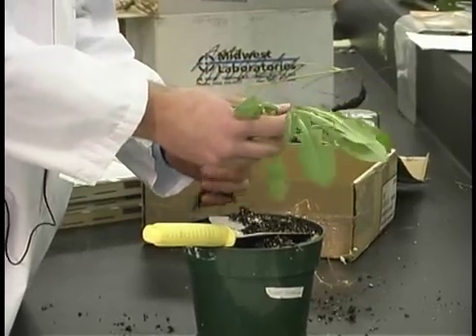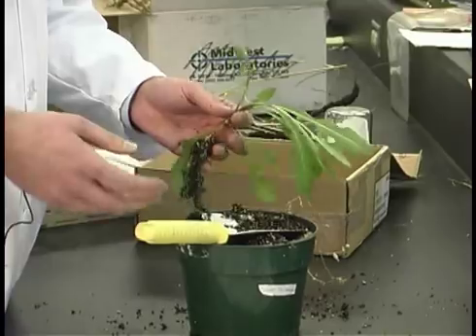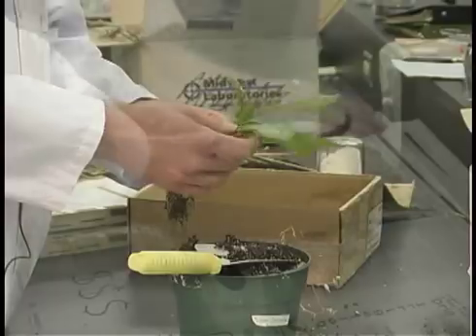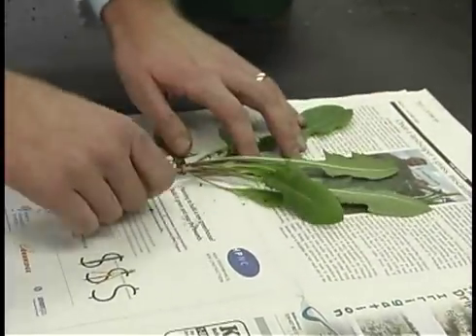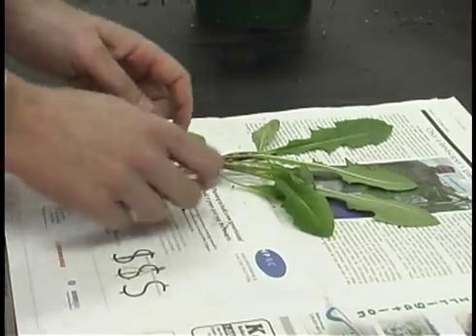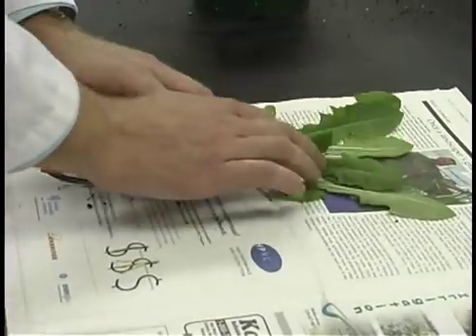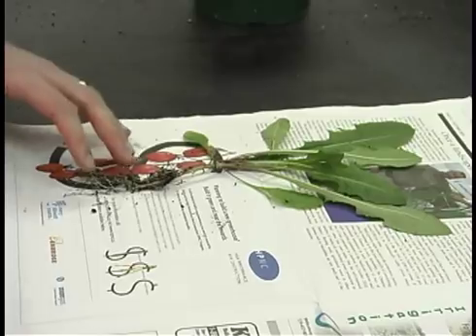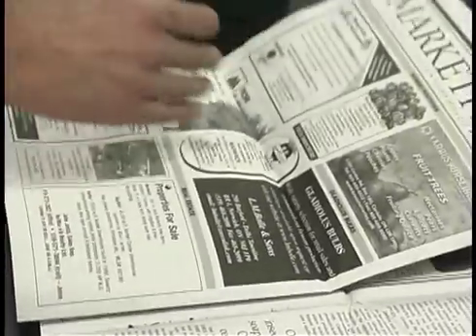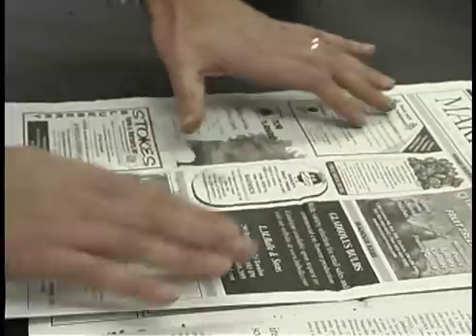Now in this example we don't have the flowers and the seeds, but if you are in a situation where you can get those, that is a big help to us in identification. Then place it on a newspaper, just as I'm doing here, spread it out a bit. This is just to press the plant and keep it in a somewhat fresh state, but to preserve all the features of the plant we need for identification.